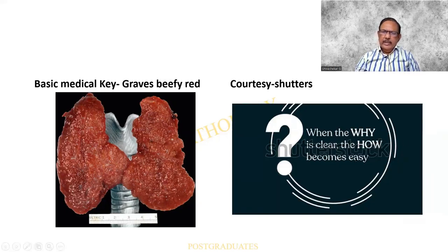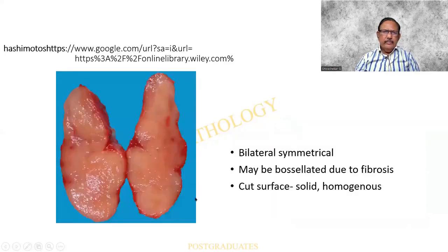When the why is clear, the how becomes easy. Courtesy Shutters. And look at the contrast over here. Here again, there is a symmetry. It is solid and not much of honeycombing is made of. No areas of hemorrhage or necrosis.